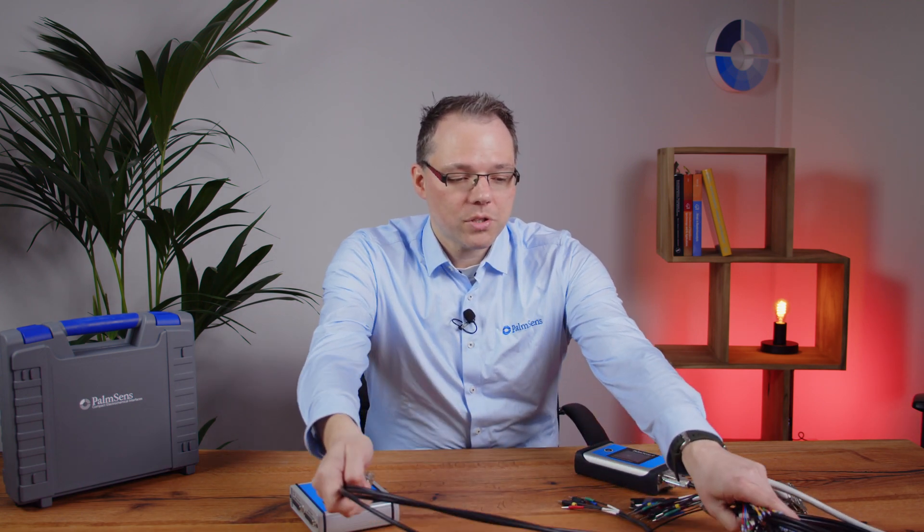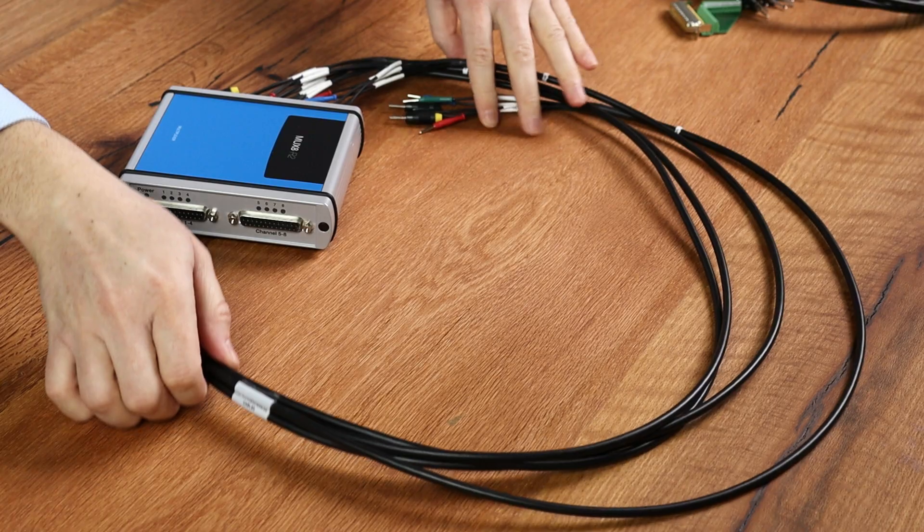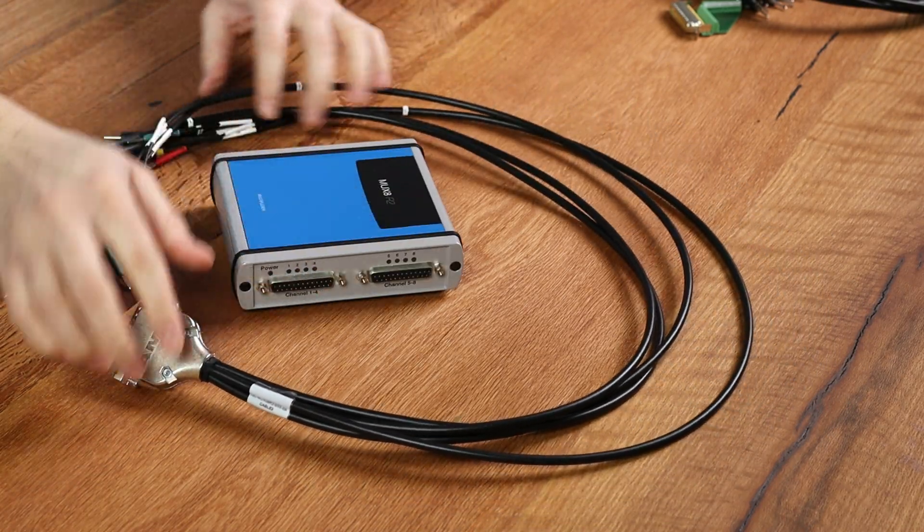Now you've seen the different options for how to connect the multiplexer, and you can individually choose these when you order your multiplexer. If you don't really know what you want to do with the multiplexer — in the sense that you don't have one dedicated project but want to do a lot of different things with it — I recommend the double shielded cable with the two-millimeter banana plugs, because it's the most suitable for most cells and applications.